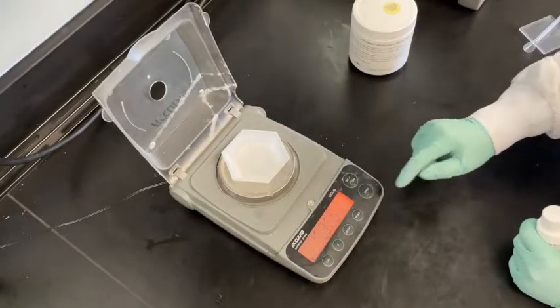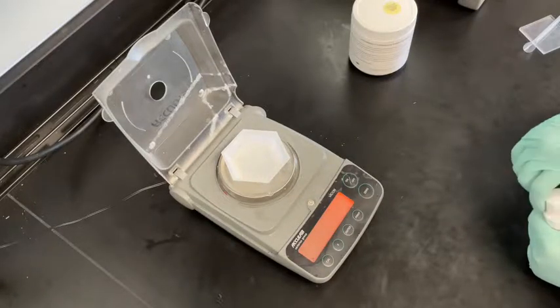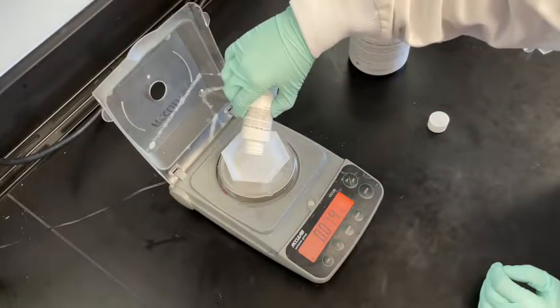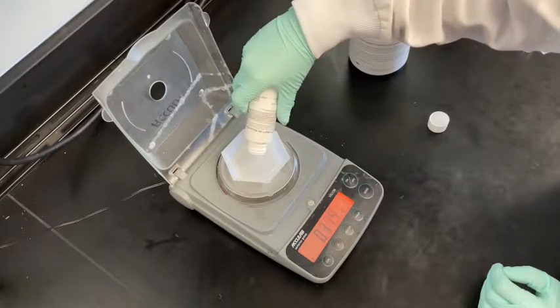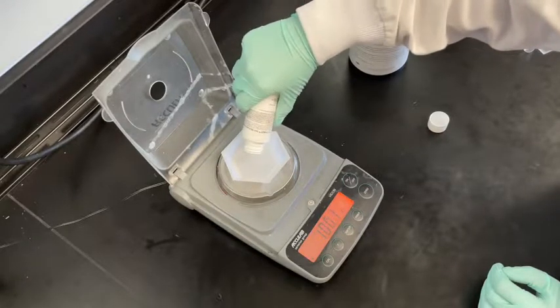Next, tare the scale again. You will then add drops of the Sylgard PDMS 184 curing agent to the appropriate ratio desired for the PDMS mixture. In our lab, we typically use a 1 to 10 ratio, so 1 gram of the curing agent is added to the mixture in the boat. The total PDMS mass needed depends on the mold design. For your information, the mixture density is around 1.11 grams per centimeter cubed.